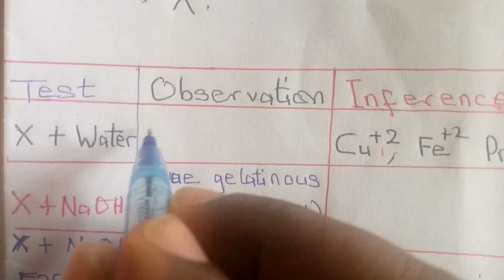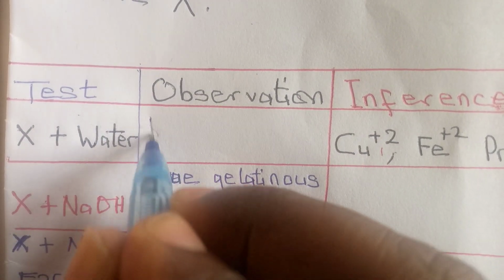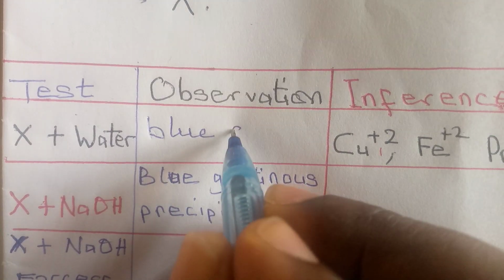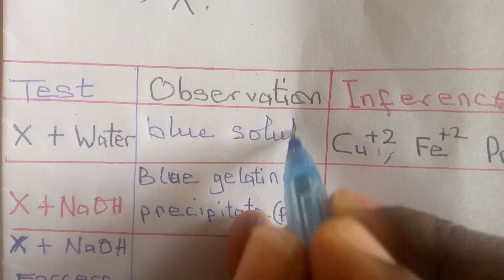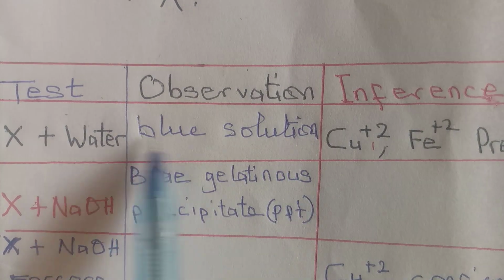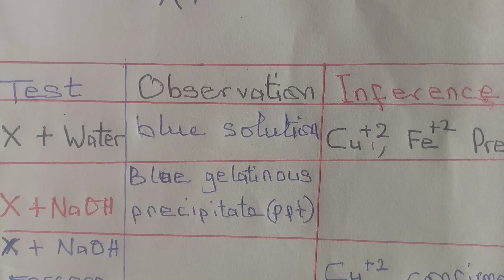So I will just come here, I will put blue solution. That means the solution will be blue. That is what you will observe.